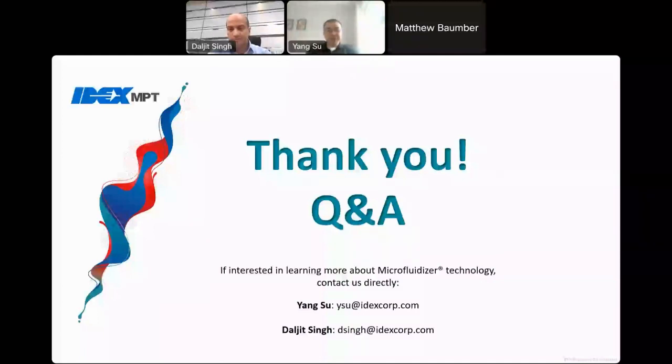If I understand correctly, is the disadvantage associated with the water and oil emulsion specifically, or with the surfactant? I'm not quite sure, but I would say in general, the technology can also be used to create water and oil emulsion. But the inherent difference is that oil and water emulsion is a lot more stable than the water and oil emulsion, because due to the surface tension, water usually tends to be a continuous phase.